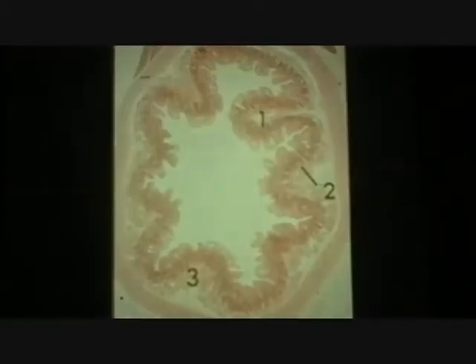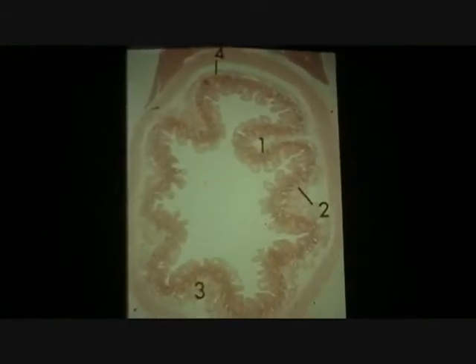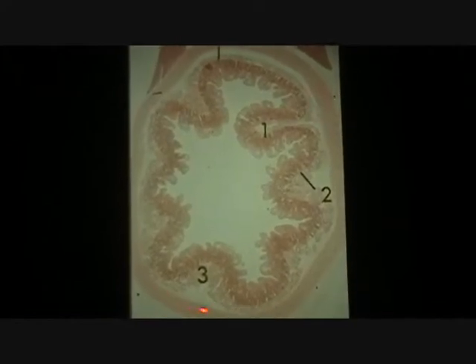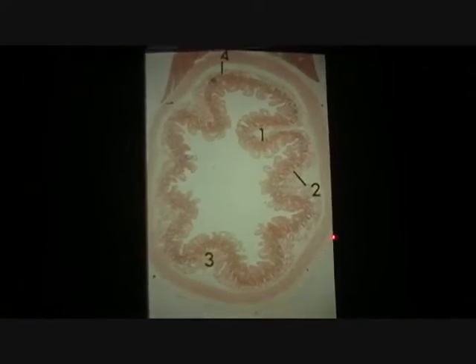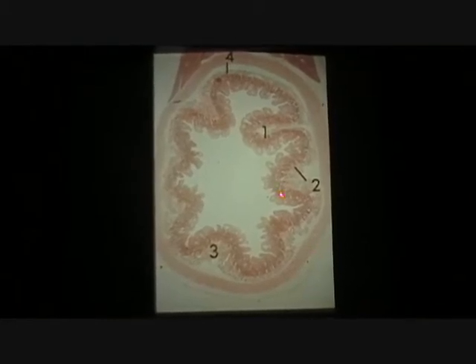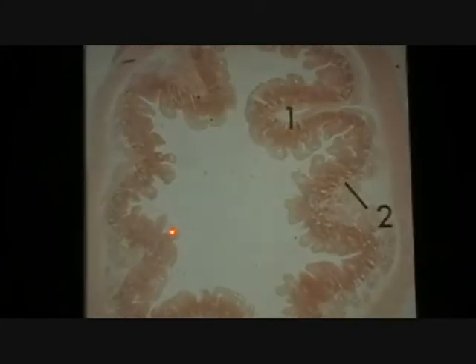And then we can put it all together. Here you've got the muscularis externa of the entire intestinal wall. Right there. You got serosa outside of it. Right there. But luminally, you go around and you say, oh, here are the little fingers. So you got nice villi sticking up there.